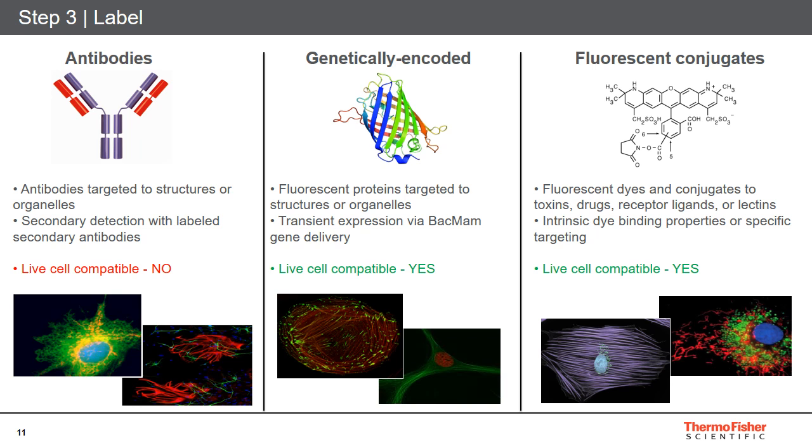Now, besides genetically encoded approaches, as I mentioned, another commonly taken approach is using small molecule organic dyes. And this is what I would like to spend the vast majority of the rest of this talk focused on: different types of fluorescent labels and molecules, and different approaches that we can take towards optimizing their use.